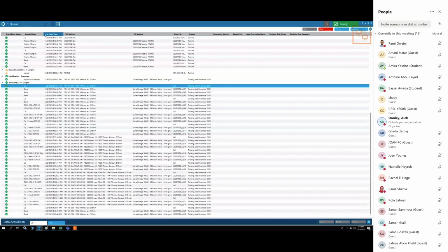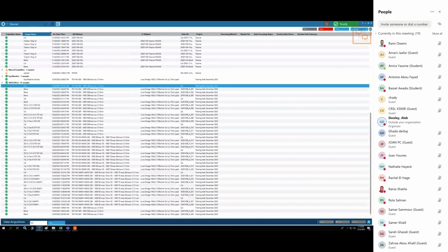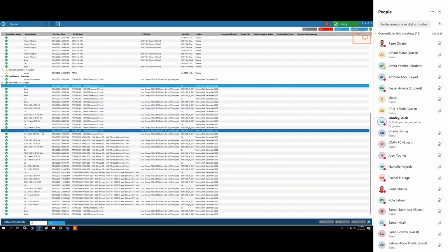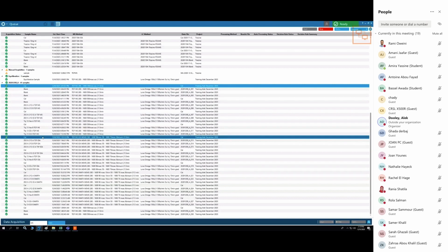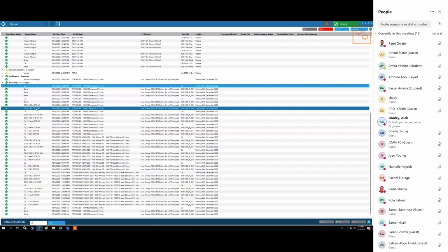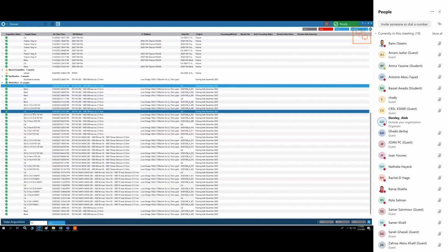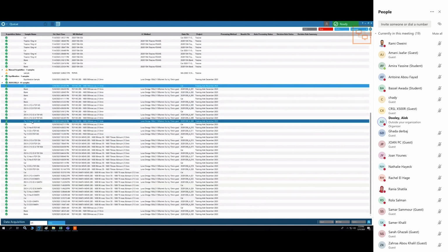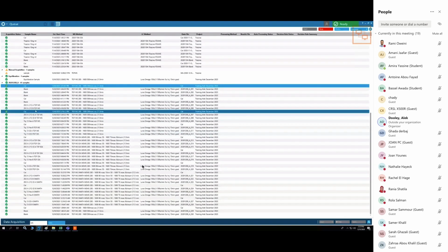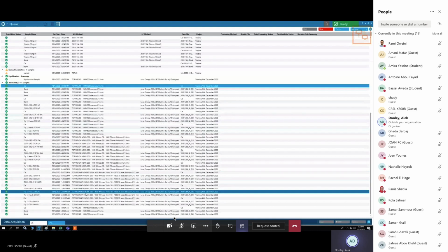All right. So yesterday we went quite quickly, so we didn't really discuss the nature of these samples. Maybe if it's okay with you, I could ask whoever is the owner of these samples to give us a little bit of an introduction. What are the samples? What are we expecting to see in them, or what do you hope to see in them? Based on that information, we can decide which sample set to start with.